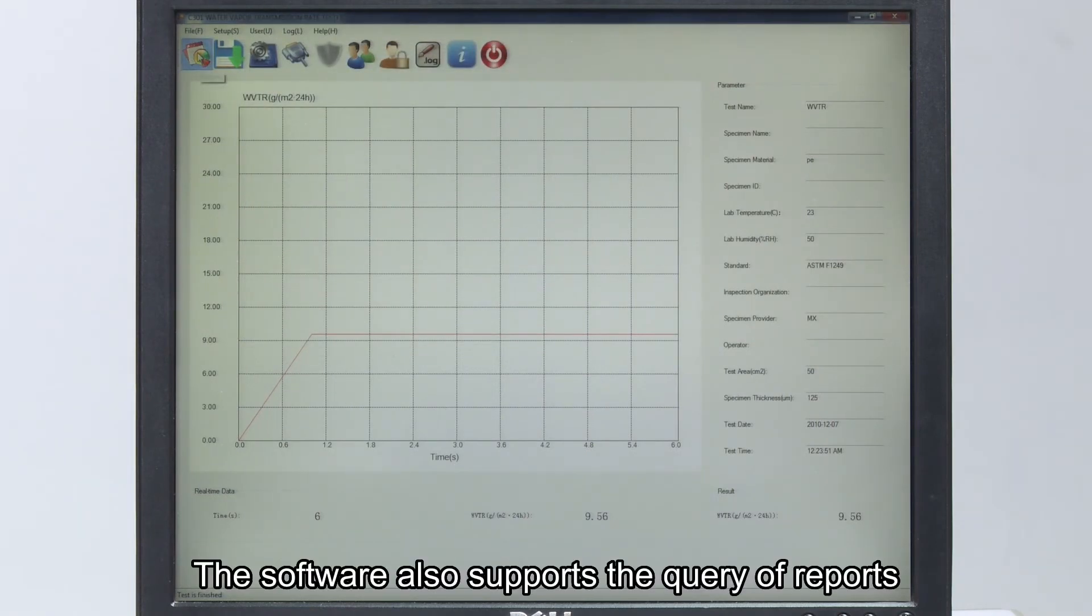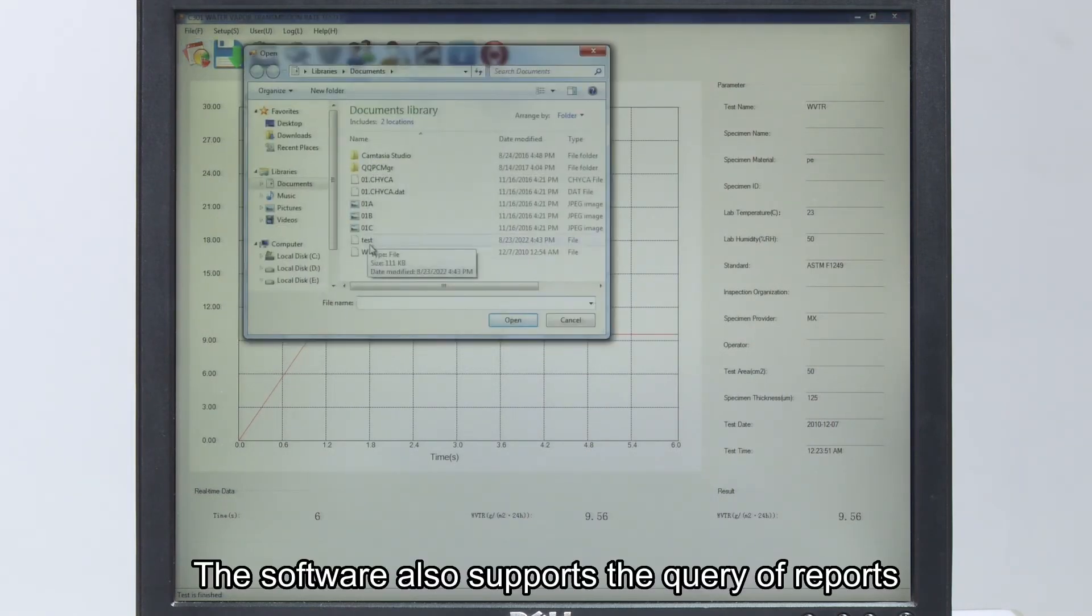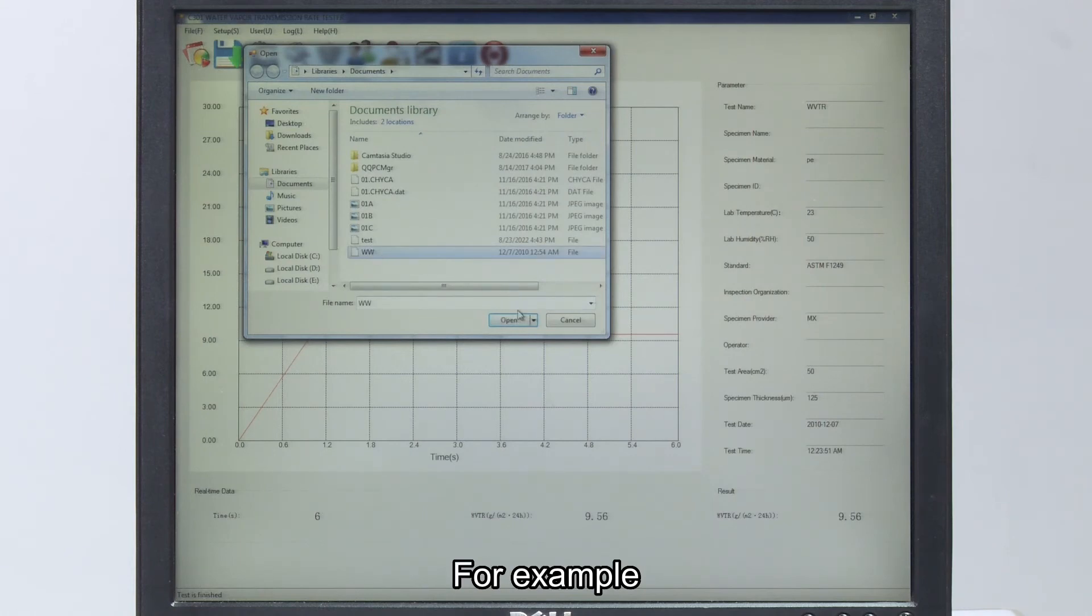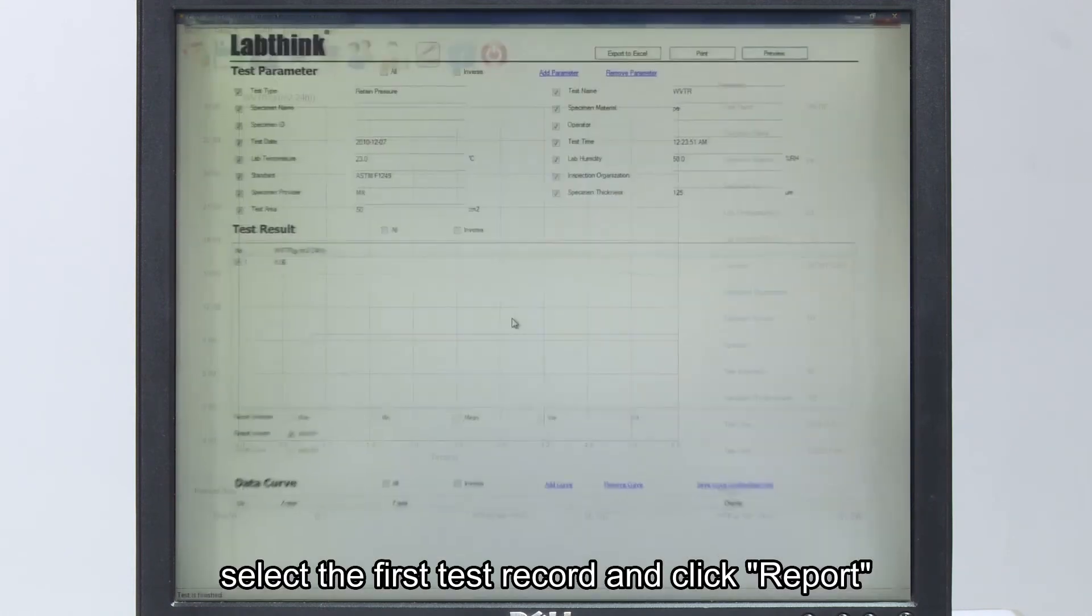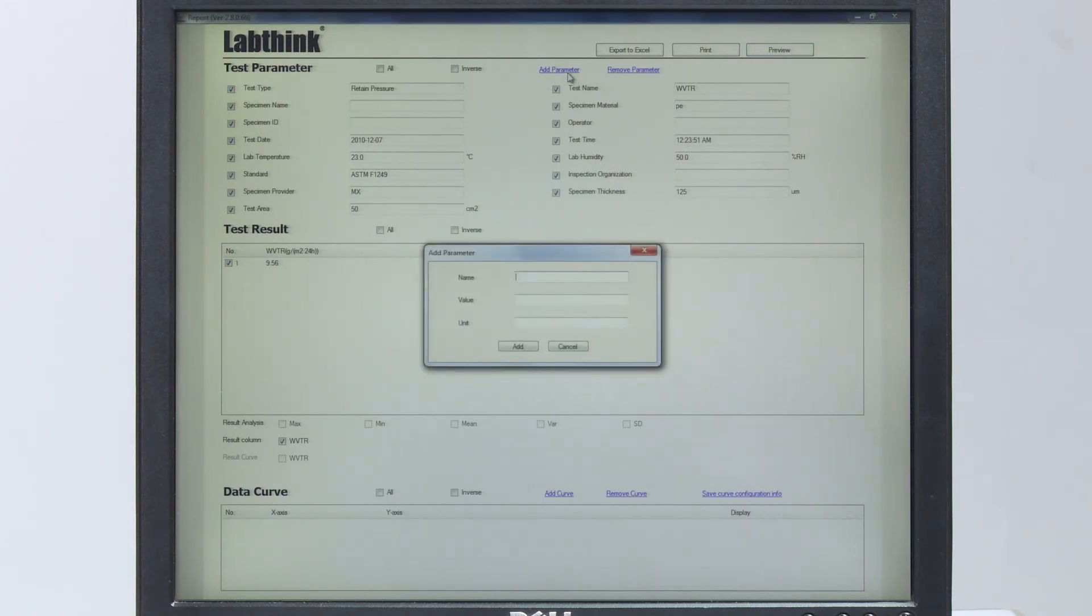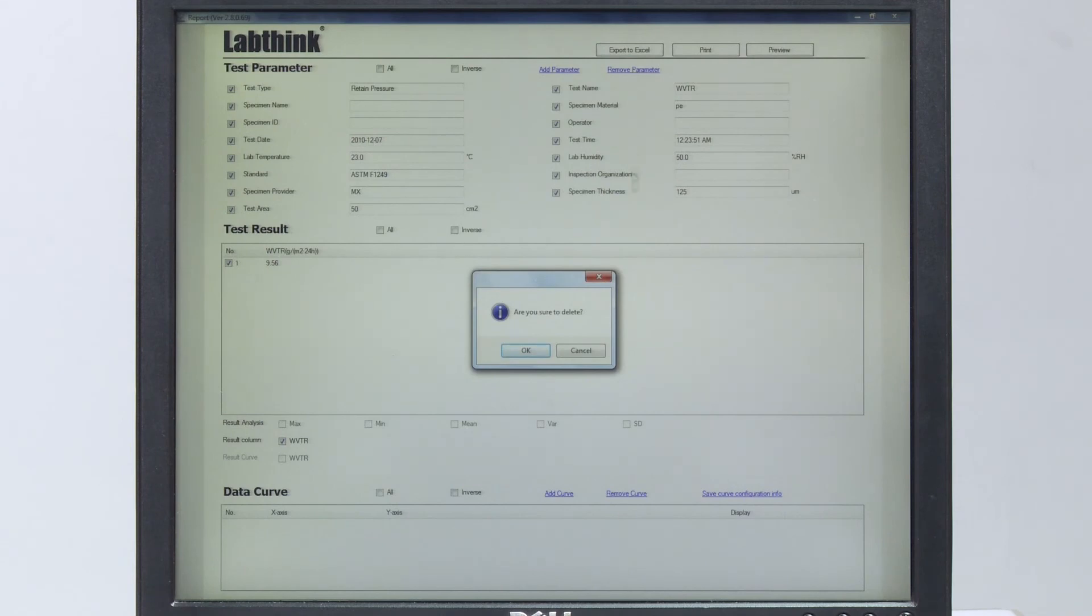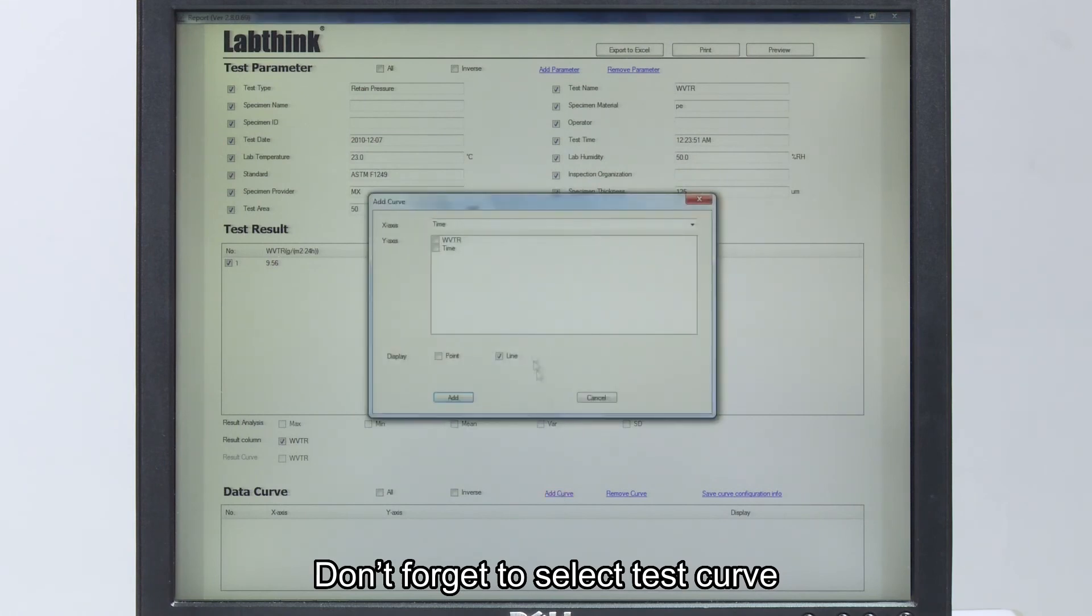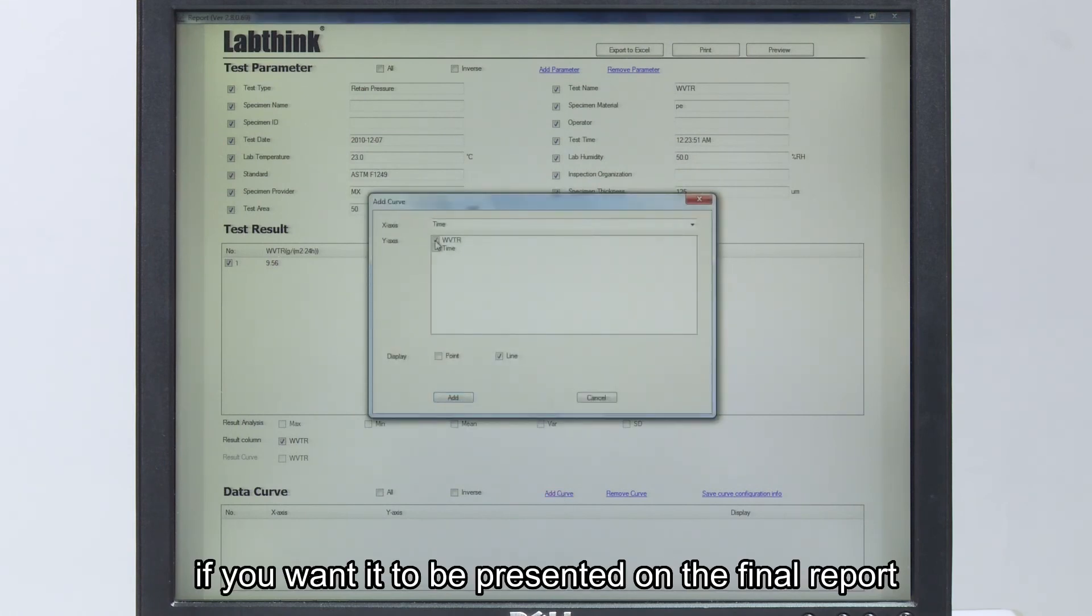The software also supports the query of reports. For example, select the first test record and click report. On the report interface, you may decide which parameters to be displayed on the report. Don't forget to select test curve if you want it to be presented on the final report.